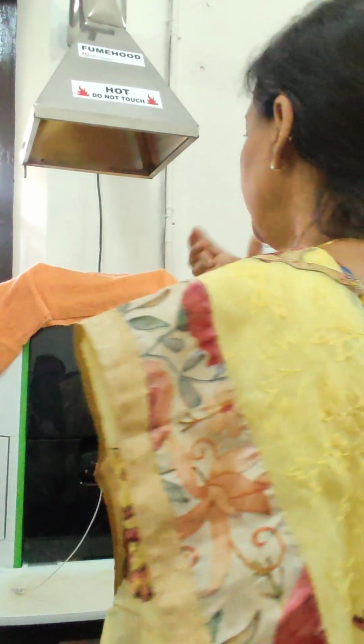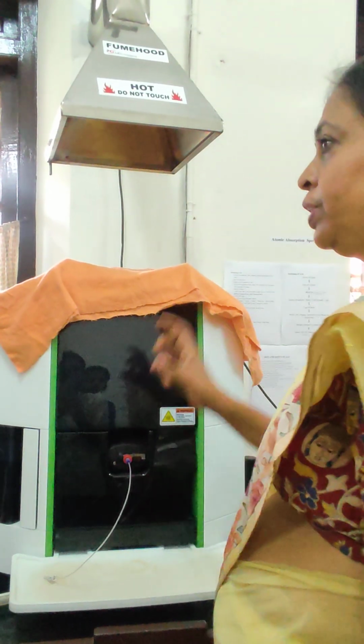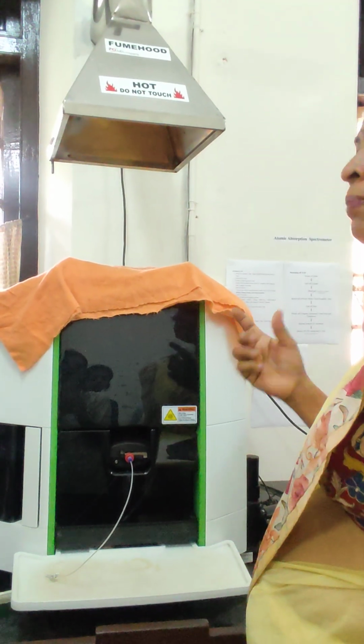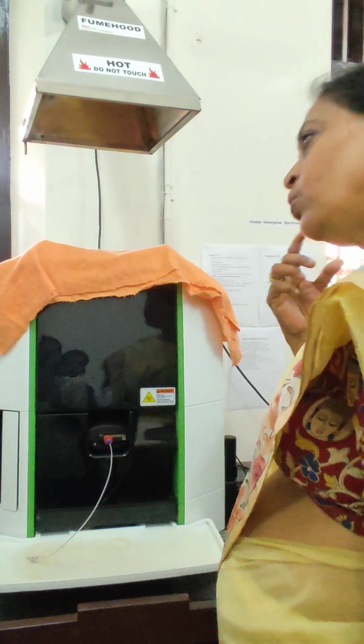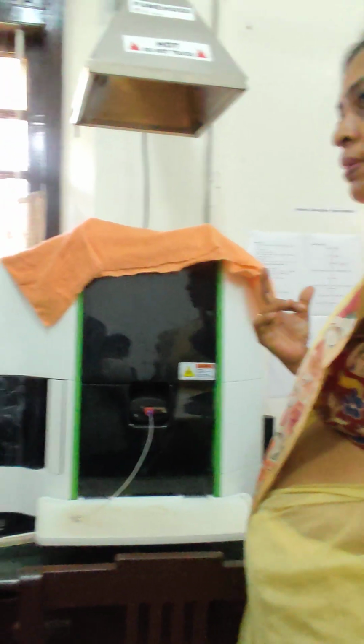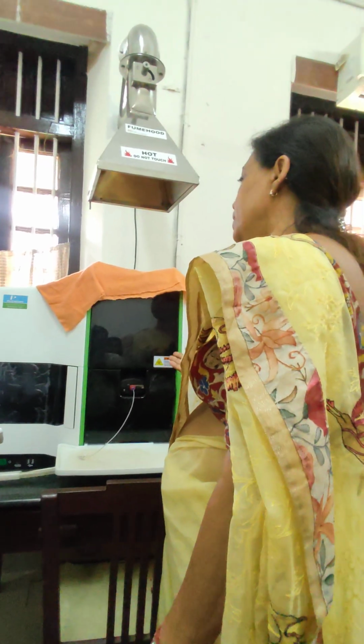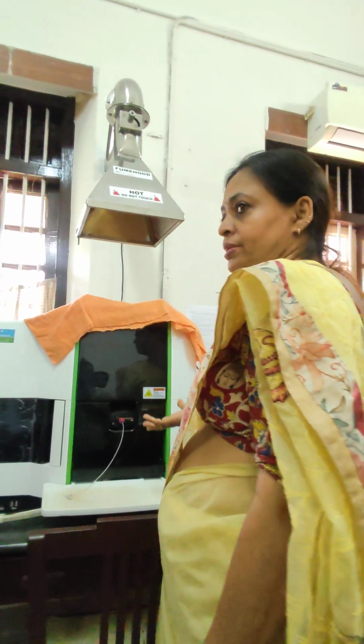Every time you take a reading, you have to change the hollow cathode lamp. For each element there is a separate hollow cathode lamp, and you have to change it. The hollow cathode lamp is very expensive. That is why this analysis is very expensive, but we have to do it. Micronutrients are very important, and we have to do this analysis also.